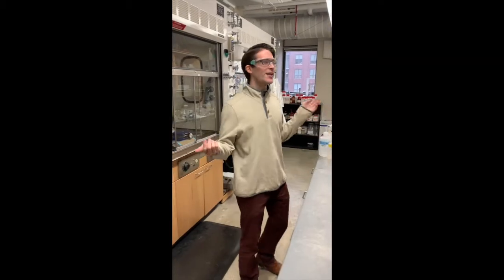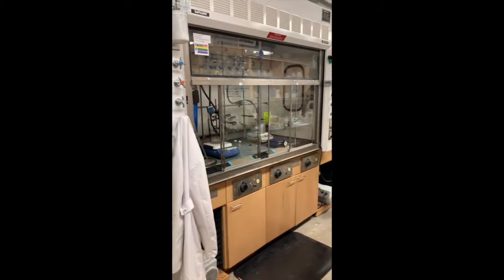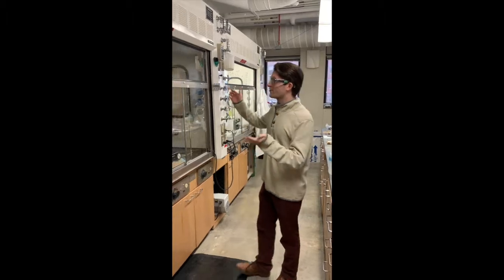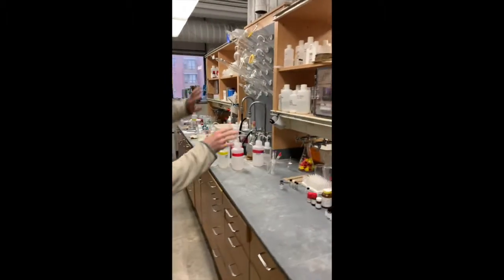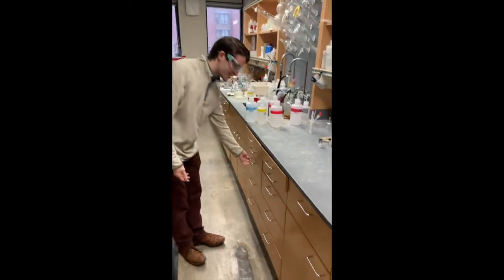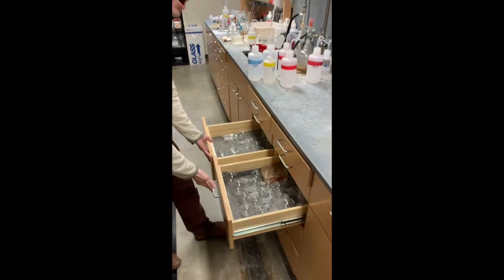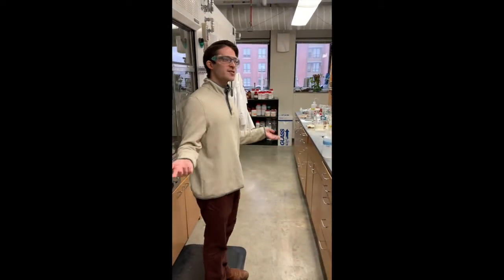So this is a typical lab setup that we have in the Yoon group. You can see that everyone has their own hoods. So this is actually my hood area, and I have the setup how I like in my hood, and then I also have the bench space, and I have just kind of all my common chemicals up on top. But this is my own little personal area, and so I get to keep my own little inventory of glassware and just kind of some common things that I typically use. And every grad student has their own setup, pretty much like this.